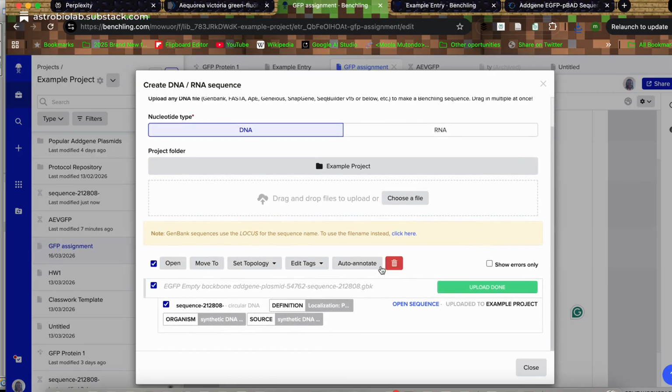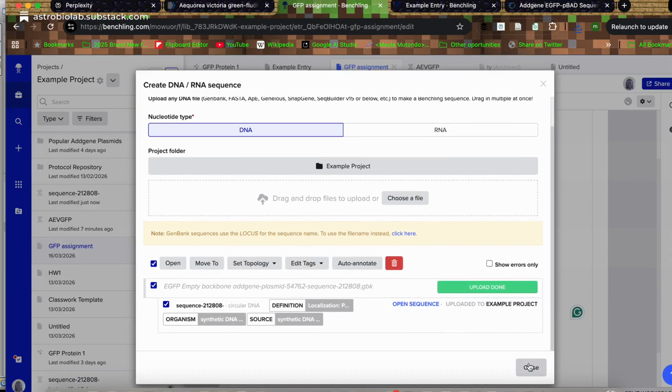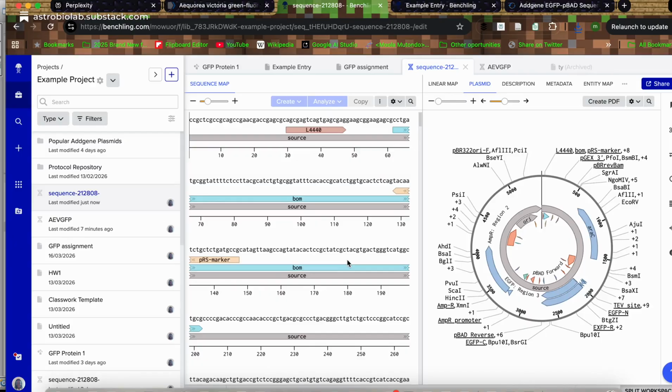Let's get it all with the annotations and everything. Did I give it a name? I don't think I did. It will probably keep the same one. So now here it is, beautifully done, where you can see all the things that are interesting.